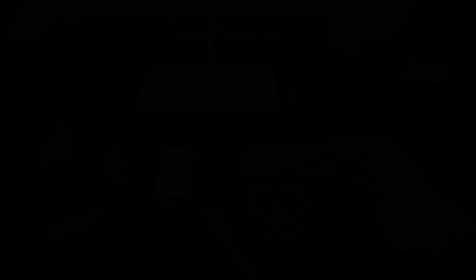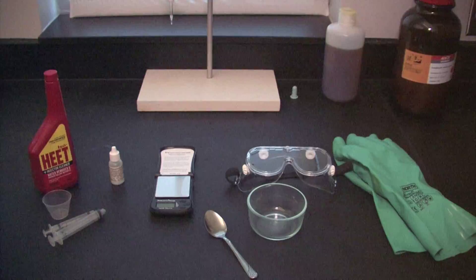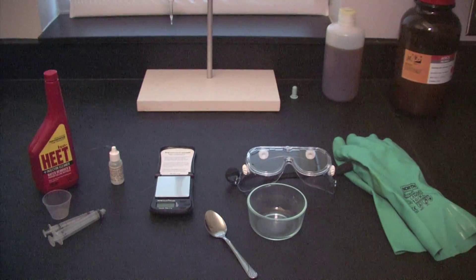In this segment we're going to show how to go through the titration process and some of the materials that are needed. These are the contents of the titration kit that we received with our biodiesel processor, and it contains the basic items that you need to go about doing the titration process.